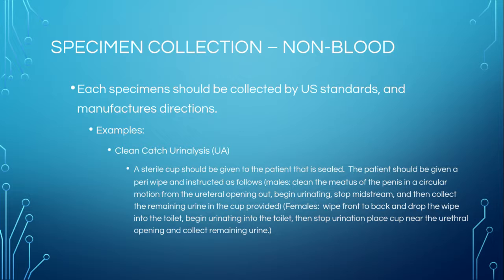And sometimes people have the same first and last name, so you have to be sure you do that. So let's talk about how you collect it. You're going to get that sterile specimen container, and you're going to make sure that it is sealed on the side.